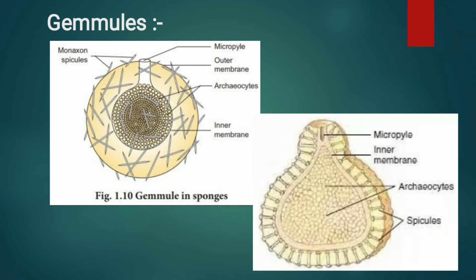Now we see the gemmules of sponges. Gemmules are asexually reproductive bodies of freshwater and a few marine sponges. These are formed in hot and cold weather to resist unfavorable conditions like drought or cold.